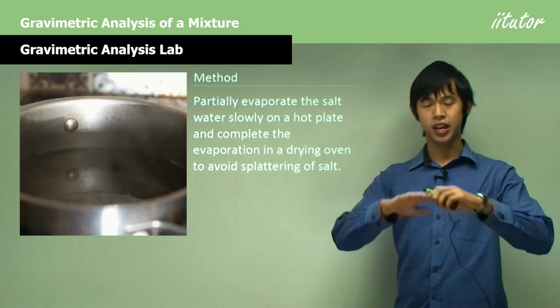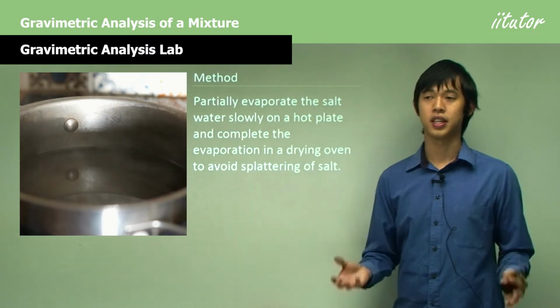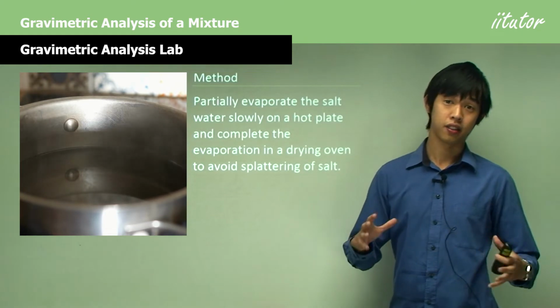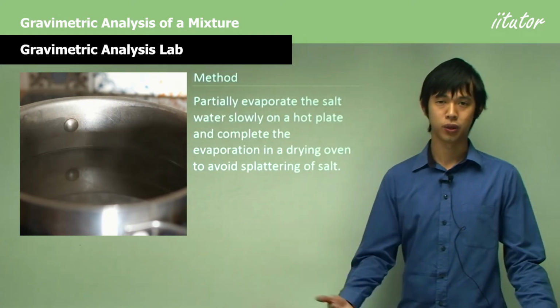The way to evaporate things has a bit of a technique to it. While I went through the overview of how to evaporate, just put it in the oven basically, there is a bit of a technique to it, particularly if you want this experiment to be done in the space of an hour or so, which would be good for you to get the results in, say, one class.